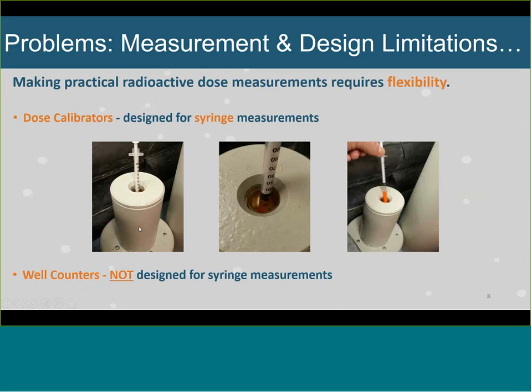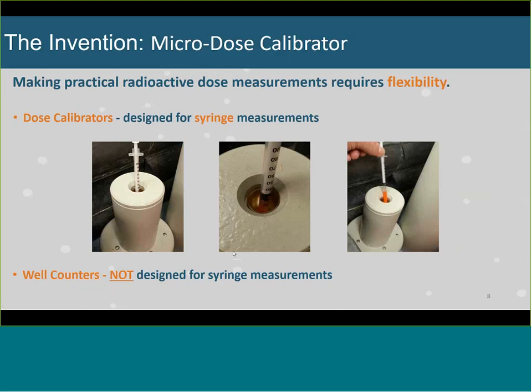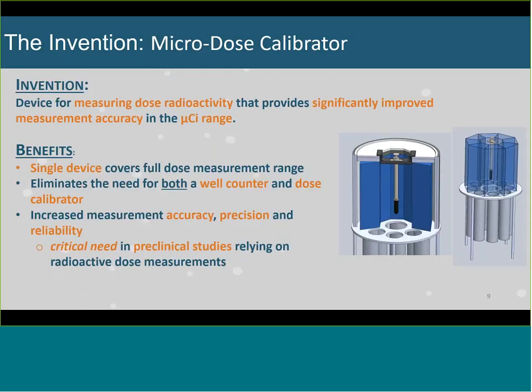or you have to put your dose inside of a small container and then extract it from the container into the syringe. And the more steps you put into trying to prepare your injection dose, the greater the chance of an error. And there's user errors, there's errors in dilutions, there's errors when you extract solutions into syringes and so on. So I just found this to be very problematic.